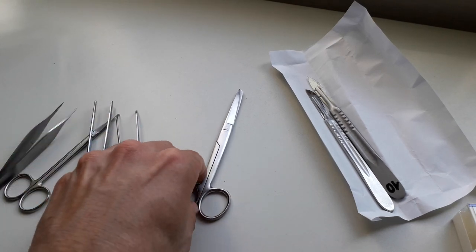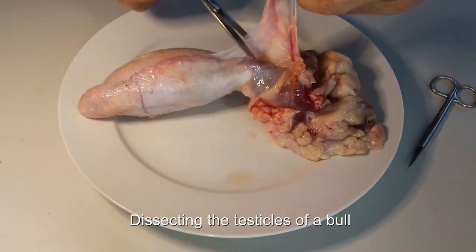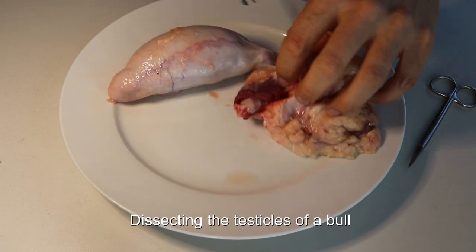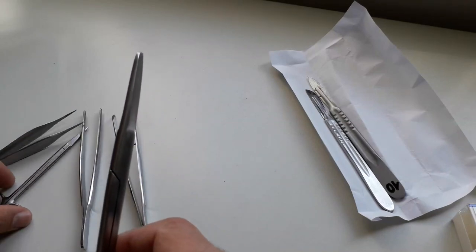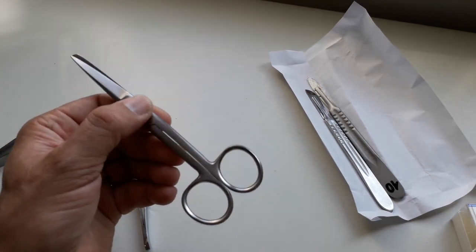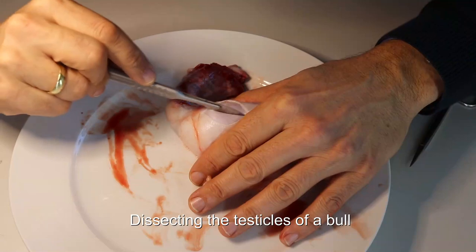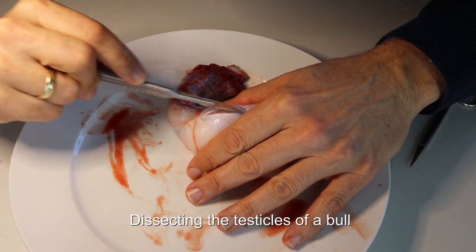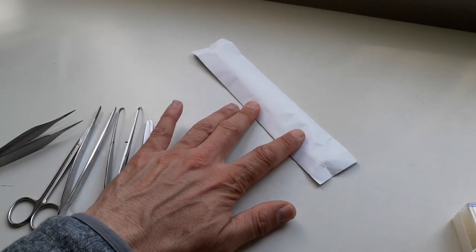A larger scissor here is also available, also not used so often. If I need to cut across the stem of certain plants, then of course those smaller scissors are not quite as strong, so I use this one here. And rarely used, mostly when I do a little bit of dissection work, are those very sharp surgery knives, scalpels. I keep them wrapped in paper so that I don't accidentally hurt myself.